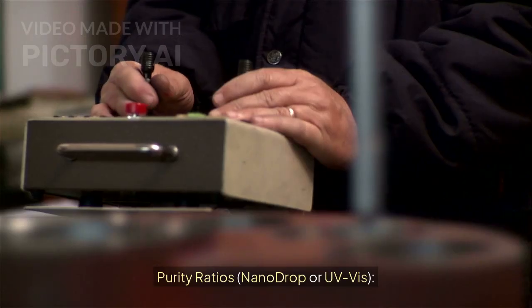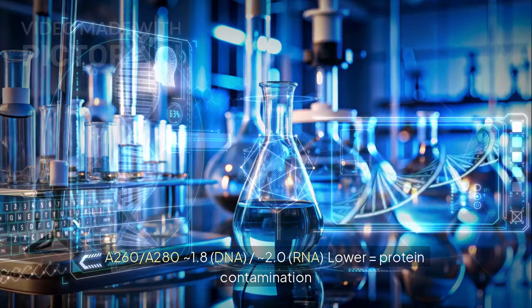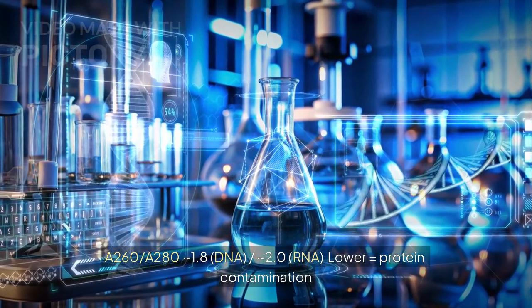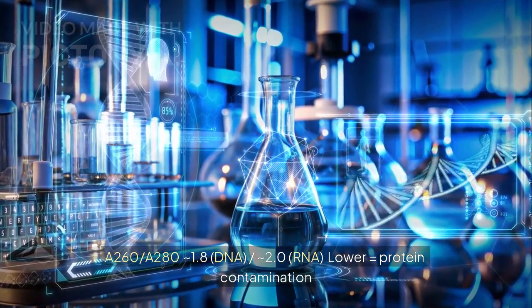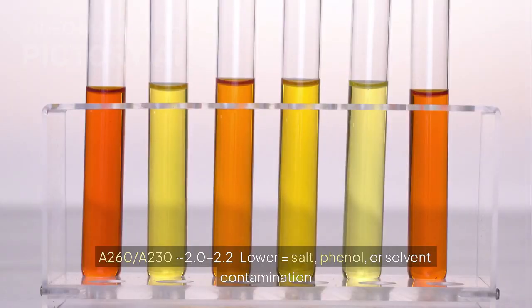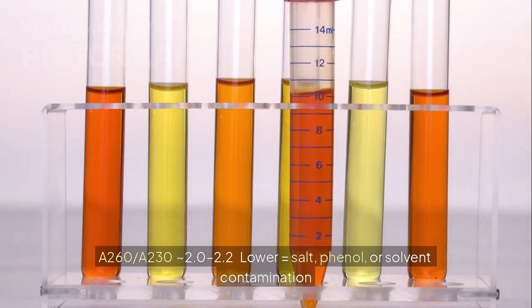Purity ratios, NanoDrop or UV-vis. Ratio, ideal value, interpretation. A260/A280: about 1.8 for DNA, approximately 2.0 for RNA. Lower means protein contamination. A260/A230: 2.0–2.2. Lower means salt, phenol, or solvent contamination.